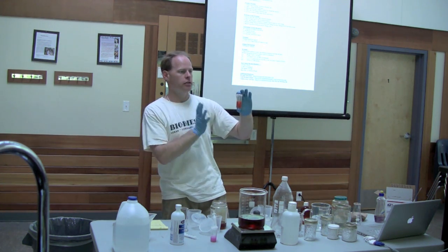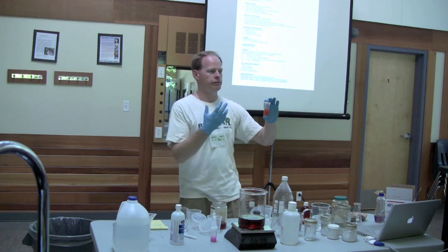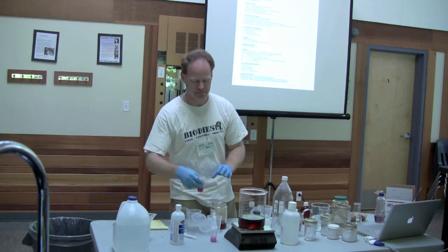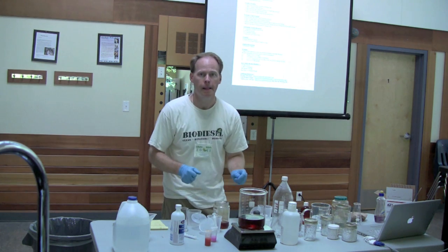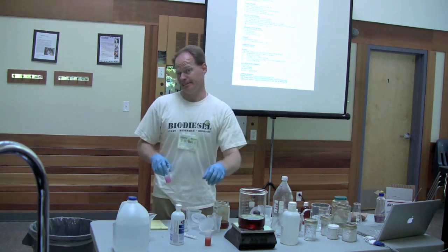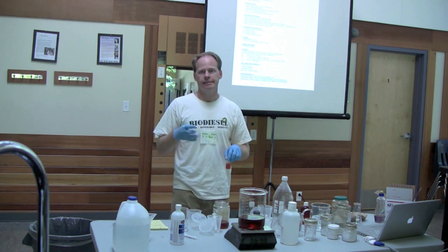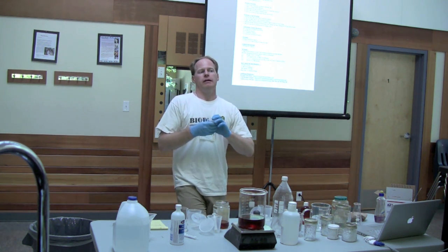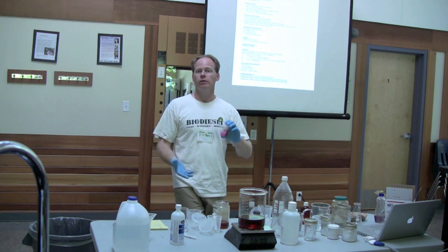But in a pinch, Walmart's around the corner, and if you've got a grocery store and you need to make biodiesel, you can go grab it and it'll work. Phenolphthalein usually has an expiration date. Does that really matter? I don't think so. They say that after about 2 or 3 years you shouldn't use it. However, I've got some that's 5 years old and it's still working.